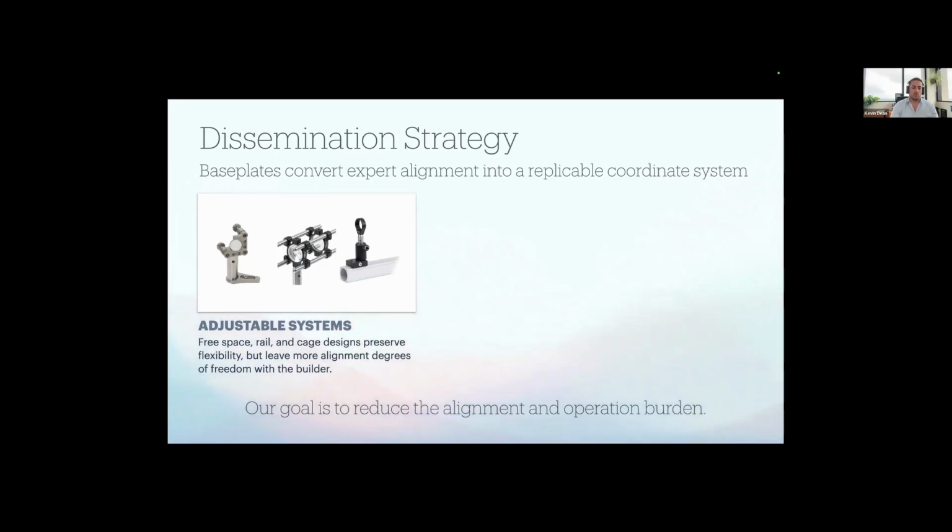And so the vast majority of labs out there aren't going to take that approach. And some of these methods that actually reduce the degrees of freedom slightly also don't necessarily provide exactly the solution that you want. So anyone that's probably used a cage system has had something aligned just right and then tightened it and secured it and then seen the beam deviate. That's not the most inspiring or faith-inspiring part of that technology.